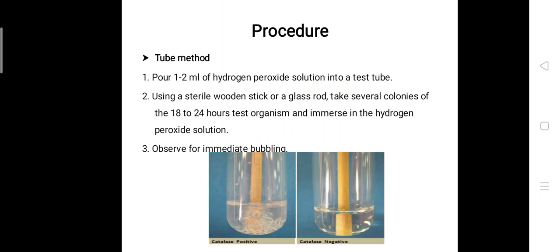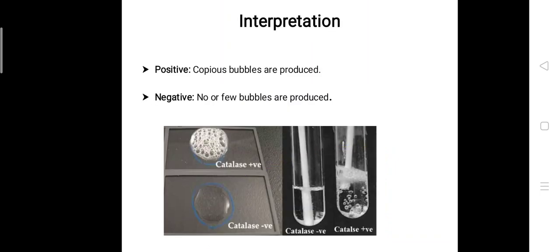Let's see the interpretation. For positive results, in the glass slide as well as in the tube, you can see the bubbling. You must be thinking, what is this bubbling? This bubbling is because of the oxygen.